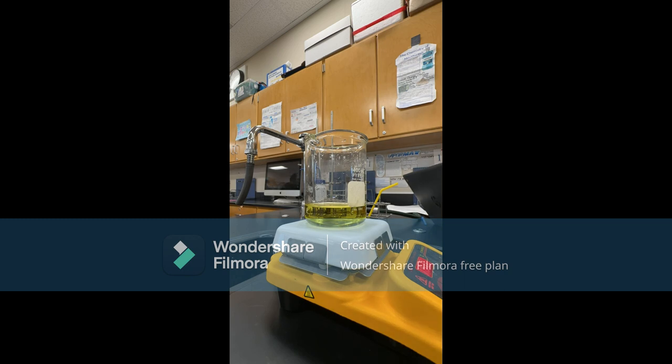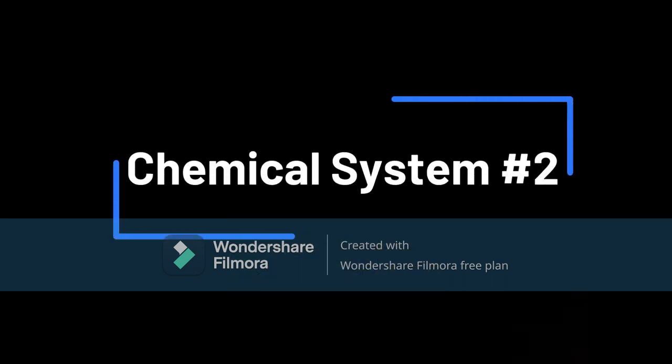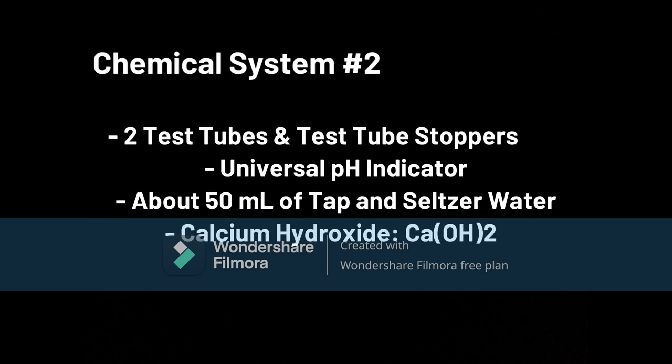As you can see, the liquid has a slightly different color than from the preheated solution. Now, for chemical system number two. This system includes two test tubes, two test tube stoppers, and universal pH indicator, and about 50 milliliters of tap and seltzer water.